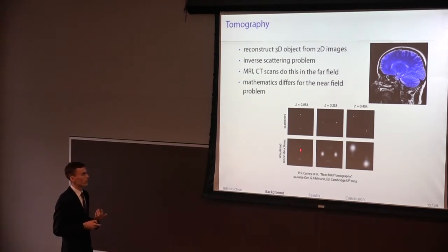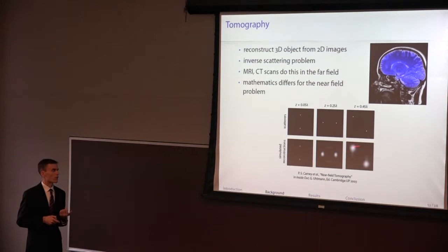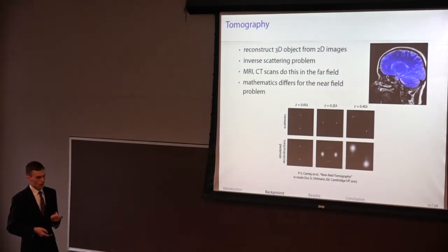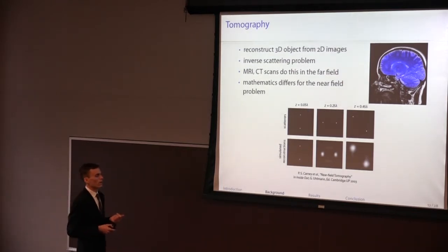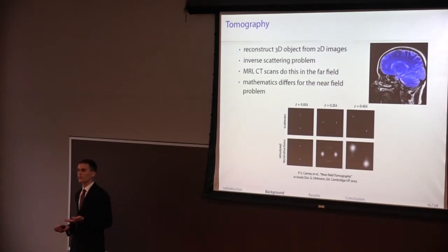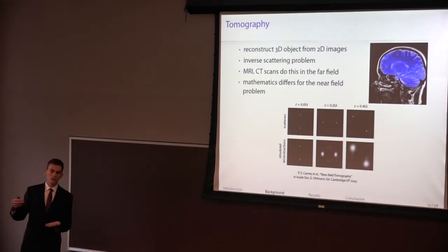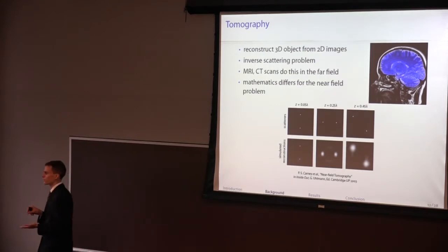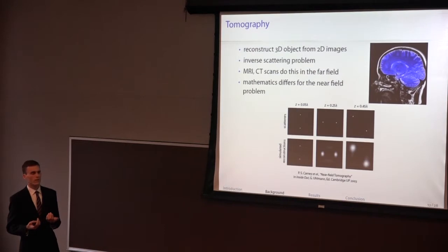Again, this is just a simulation, but you see they basically resolve the placement of the point scatterers with lowering resolution as you increase in depth. So this type of analysis actually requires a lot of additional information. You need to do multiple scans. You need to have illumination from different angles. It's really just quite a bit more information than the instrument that I'm using can readily provide to me right now.